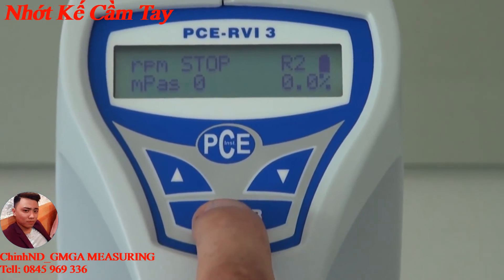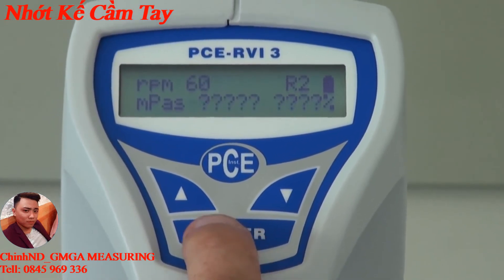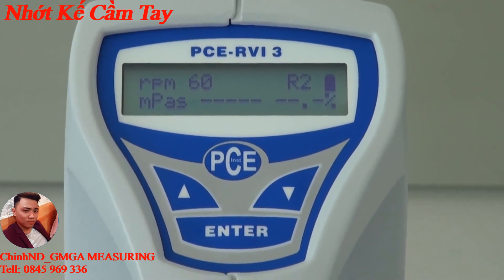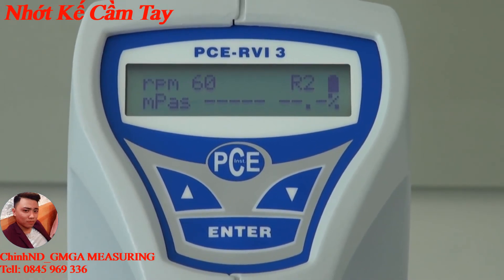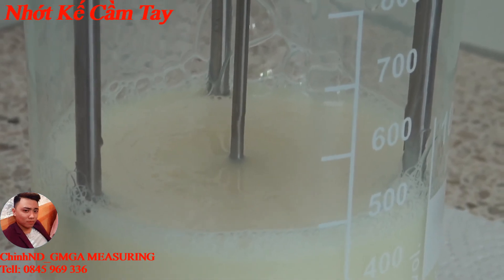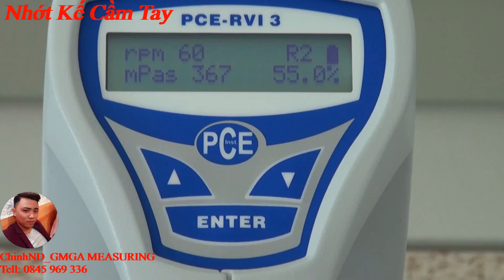By activating the enter key the measurement is started. First the rotation spindle starts to turn until a constant revolution is achieved — here it is 60 revolutions per minute. Subsequently the measured result is shown in milliPascals.